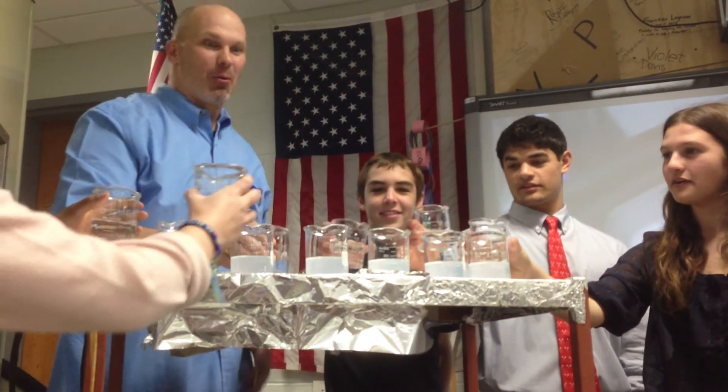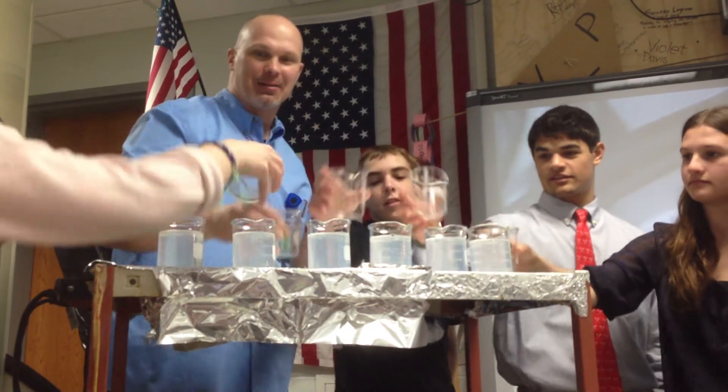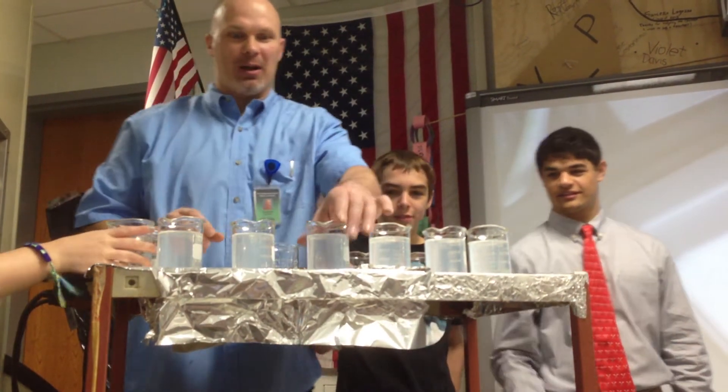In your beaker — one, two, three, pour. Put it down, get out of the way. See if we get what we want, what we like here.